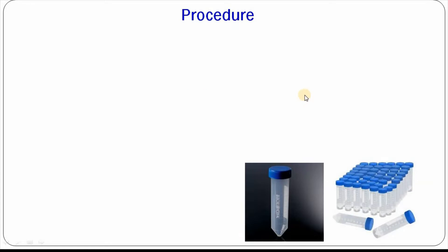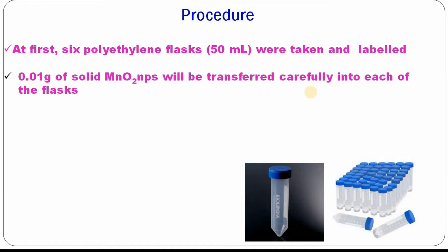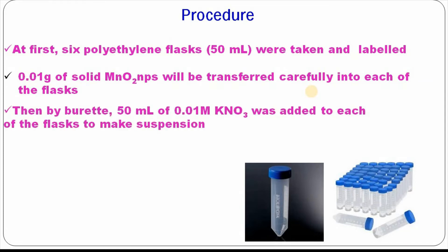Now, the procedure. This procedure is reproducible, so a new researcher can follow it and determine the point of zero charge. Several polyethylene flasks of 50 ml were taken and labeled. Then, 0.01 g of solid manganese dioxide powder was taken into each flask. Then, by burette, 50 ml of 0.01 molar potassium nitrate was added to each flask to make a suspension.